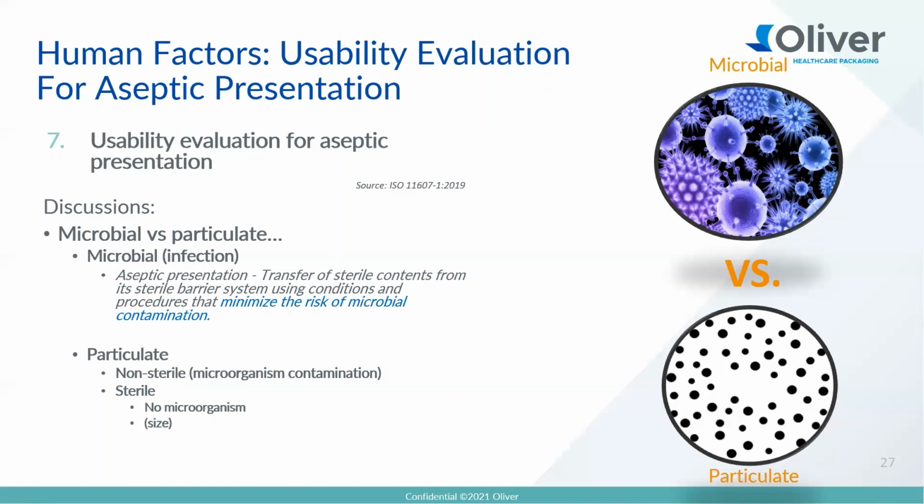So again, I want to acknowledge that particulate may make a difference or not, but when we're talking about aseptic presentation, when you introduce particulate, you need to assess whether that particulate is really sterile or non-sterile.